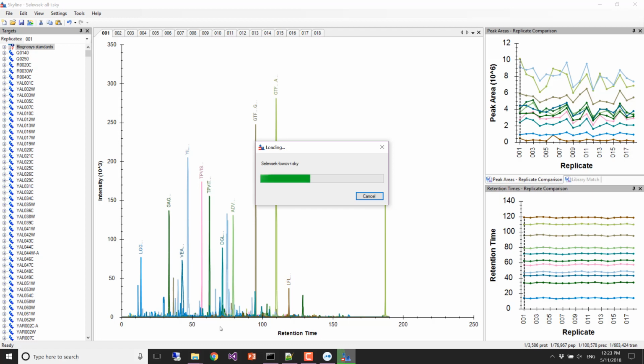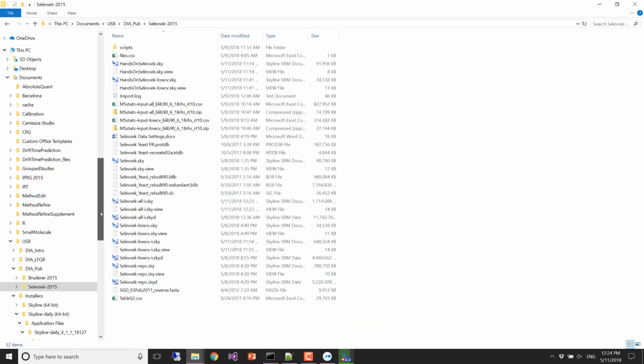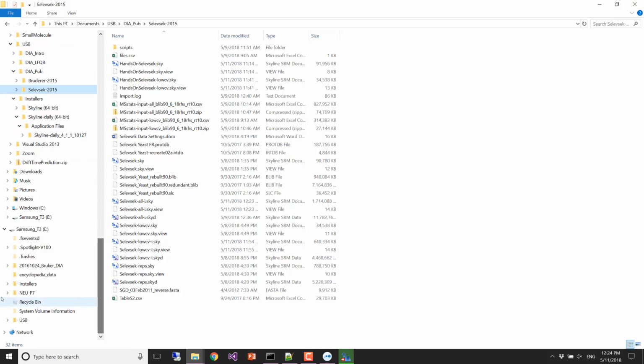This kind of DIA processing, we can look at the file sizes. If you were here for session 1, dealing with SRM or even PRM data would be fine. The file sizes are way smaller, and everything processes much more quickly. This is the first time we've tried to teach this scale of data on laptops.